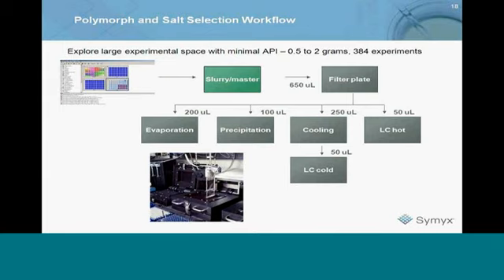Yeah, we've actually done a fair number of things. We've done things with looking for known polymorphic forms, trying to really understand that and trying to understand, in some cases we've done that trying to find either a more efficient process or a more convenient process or a more cost-effective process to generate a particular polymorphic form. In some cases, just from a process development standpoint, one is interested in finding something of a more optimal crystallization conditions or looking at the crystal habit.